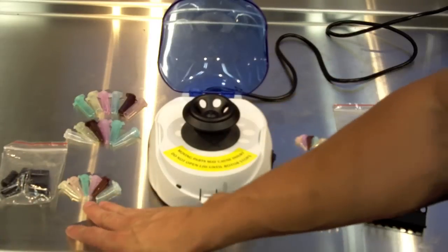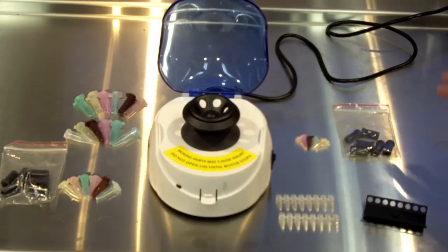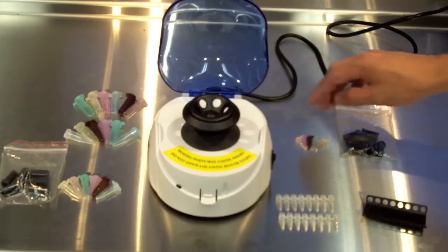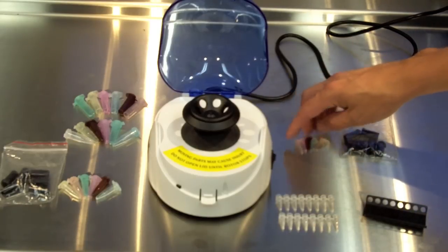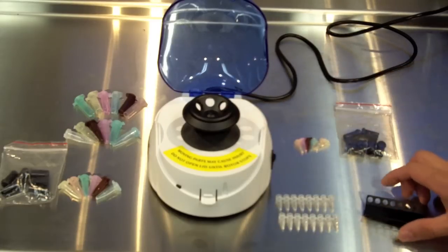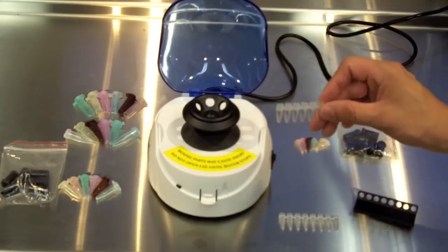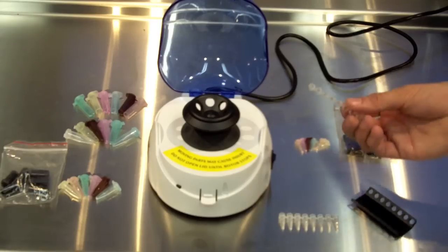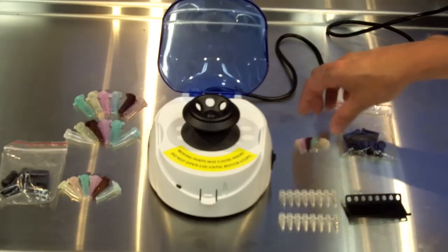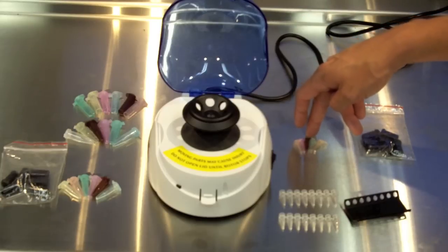You also get adapters to adapt the 0.5 mil microfuge tubes, and you get adapters to run 0.2 mil PCR tubes in the standard rotor. You can also replace the rotor with the rotor for the PCR strips. And in this rotor, you can run the PCR strips or 16 of the PCR tubes.